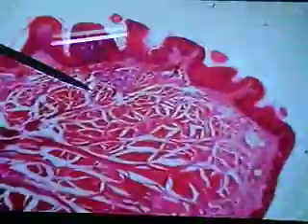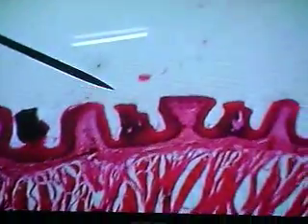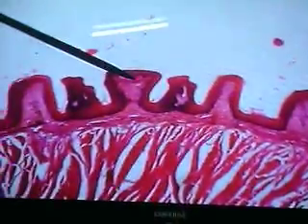One of the diagnostic features we see is a lot of fat, and the skeletal muscle, the undersurface, lacks the papillae, and on the top of the tongue here, we see a lot of various types of papillae. And in this slide particularly, what we're seeing are the filiform and the fungiform. That's a good example of a fungiform papillae right here, but sadly, there are no taste buds on this particular one. Alright? But that's a good example of a fungiform papillae.